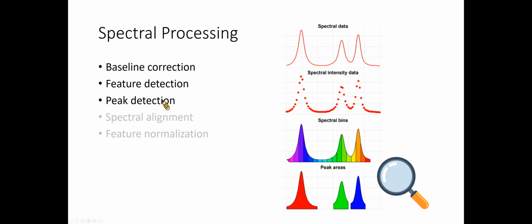These methods detect the peaks across the spectrum and integrate their areas to provide a quantification of the underlying metabolite. Peak detection includes two analytical steps: smoothing and peak filtering. In the first step, the spectra are smoothed using different filters such as a moving average, Gaussian distribution, etc.